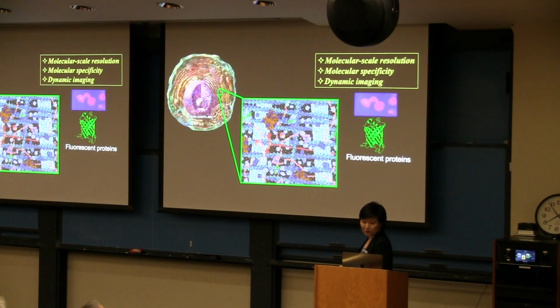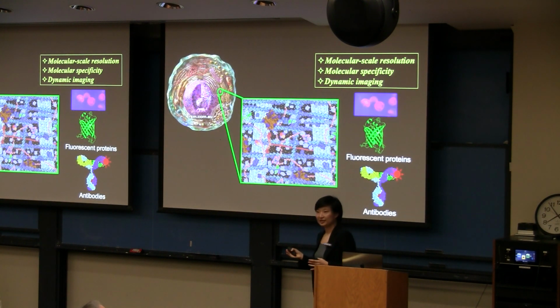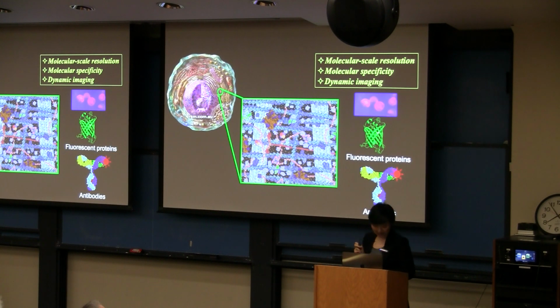And the molecular specificity often comes from labeling, because first, light has so many different colors, and second, there are so many different colored fluorescent probes. These could be natural biological objects such as fluorescent proteins that you can link to the biological molecules of interest with specificity by genetic approaches, or it could be things like antibodies that not only are responsible for our immune response, but can be used to recognize specific protein molecules. And then you could also put fluorescent dyes. So with these labeling approaches, you can light up a specific biomolecule of interest and study that.